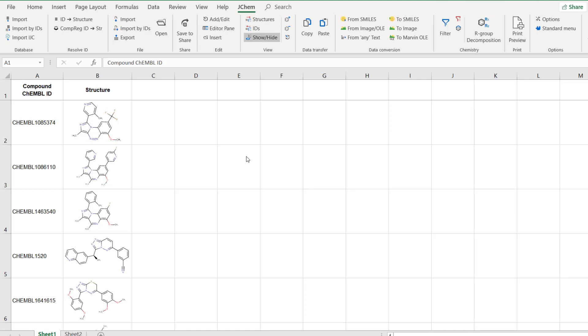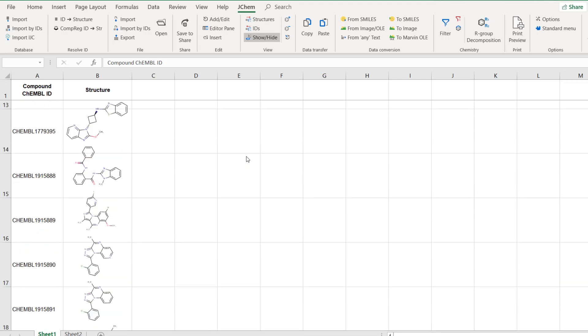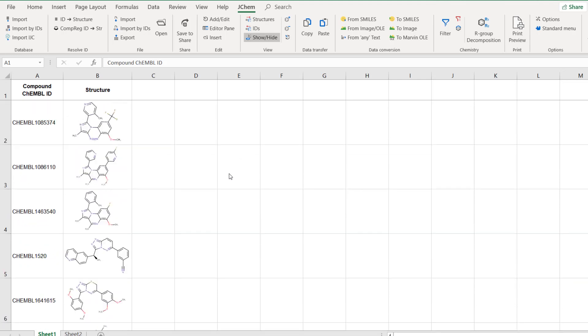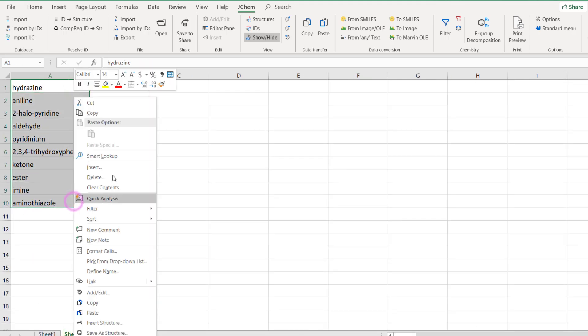In this spreadsheet there are 100 compounds and the goal is to check if they contain any of those structural moieties that are listed in the second tab. First I copy these names and paste them in the first row of sheet 1.